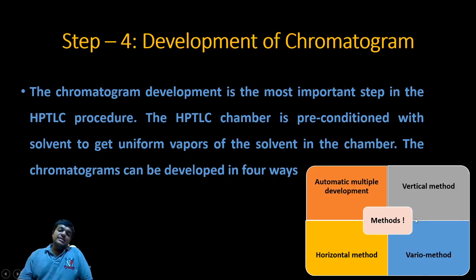Friends, as I have told you earlier, today we are focusing on the engineering or the mechanical part of the instrument, because this instrument is more to be learned mechanically rather than learning its chemistry. So we'll not go into detail as of now into all these 4 parts. They are going to be connected in the coming phases, after 1 or 2 months, but we are directly focusing now on the mechanism of the instrumentation, how it develops the chromatogram.